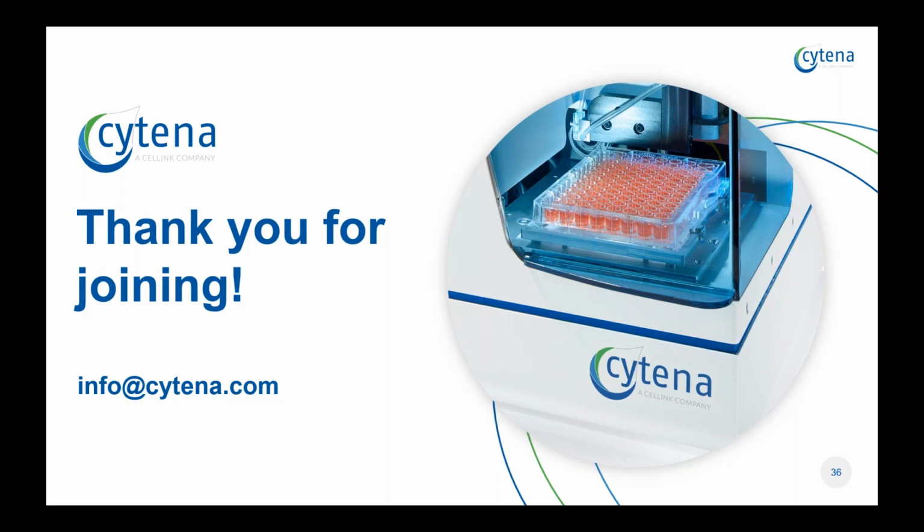There's another question regarding the sample preparation. Somebody asked whether the fecal samples have been pre-cultured or not. And I think both is possible. The data I showed you today, I believe the samples from mice were pre-cultured up to 24 hours before they were processed with the B.SIGHT.